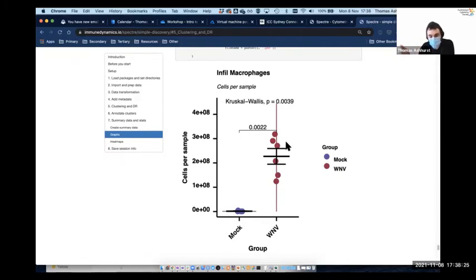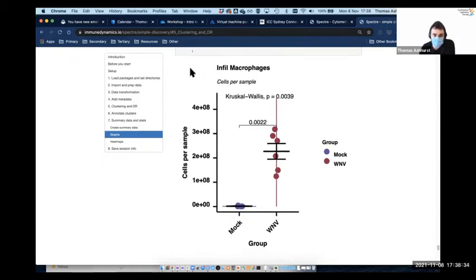And so we very quickly get from our raw data, through the clustering, through the annotation, and then through to some meaningful statistical analysis. This is by no means the end of the statistical analysis. You may go on to do more complex things, but this is really just designed to give you a simple set of comparisons between your experimental groups so you get very quick answers out.